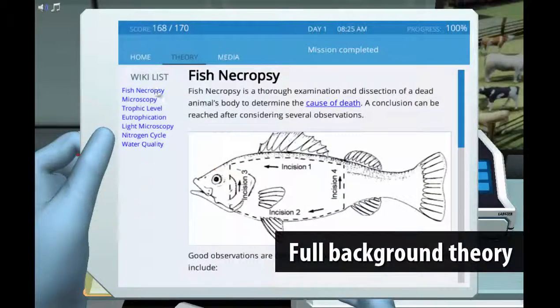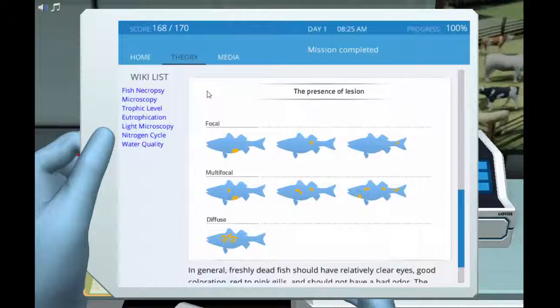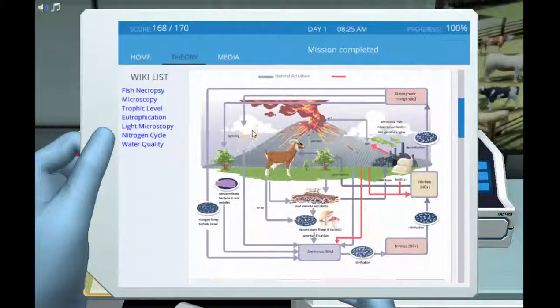Besides the core lab, Labster provides a full theory section, which provides the student with relevant background information when needed.